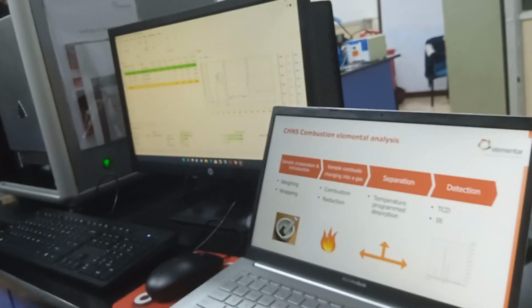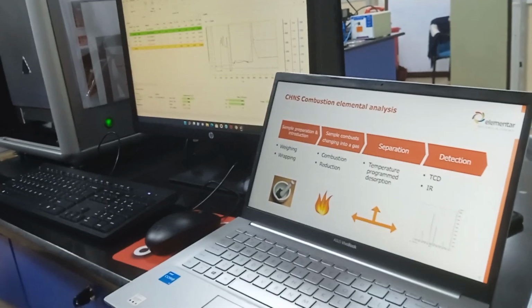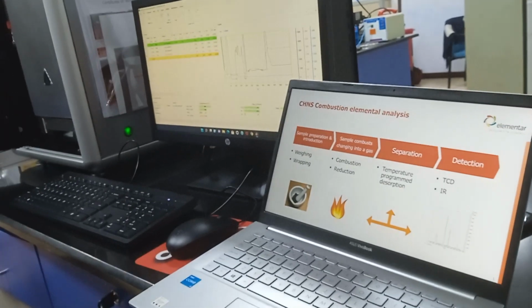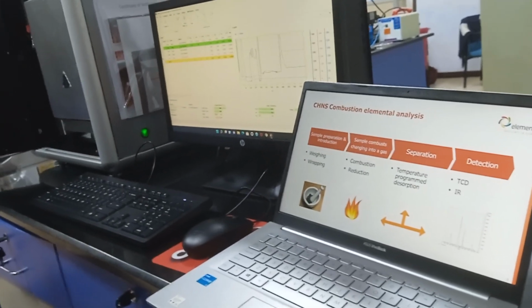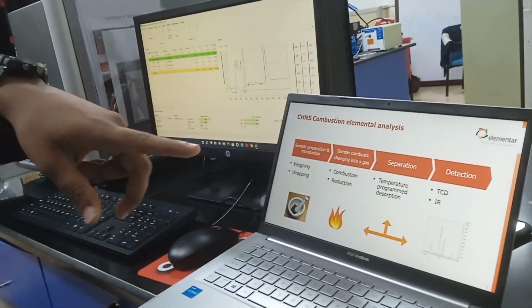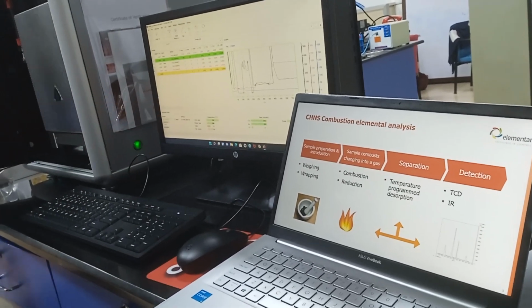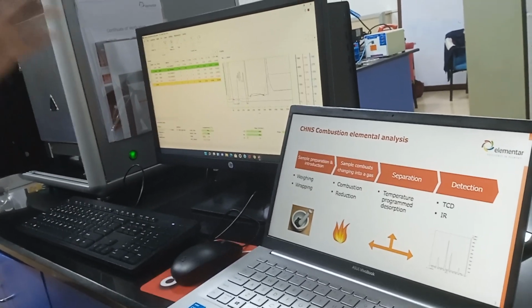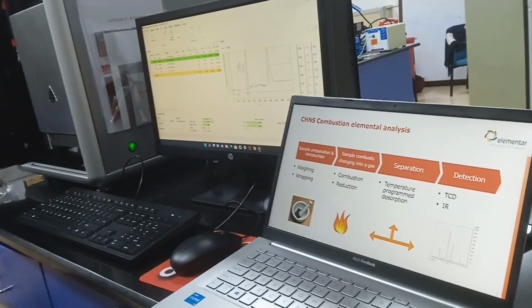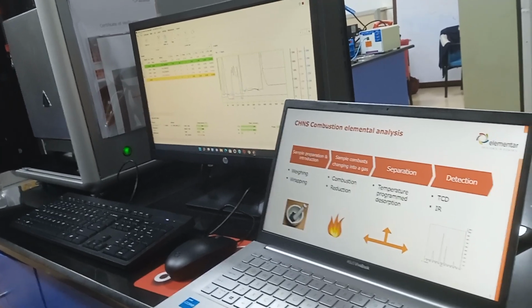So you never know. You cannot find it. It's a minute particle. You are holding up to 1, 2 mg, 5 mg, something like that. A particle you cannot see might be lost. You record a certain weight in this one, and you put a certain weight in this one, but there is less, so the result won't match. I'll show how to prepare a sample with solids.